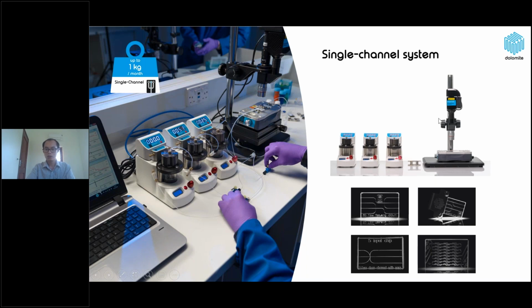So the system was designed to be very flexible. Using different chips, you can achieve different applications. For liposome and lipid nanoparticle generation, using different chip geometries, we can generate a different range of nanoparticle sizes and also different production rates or throughput of nanoparticle generation.